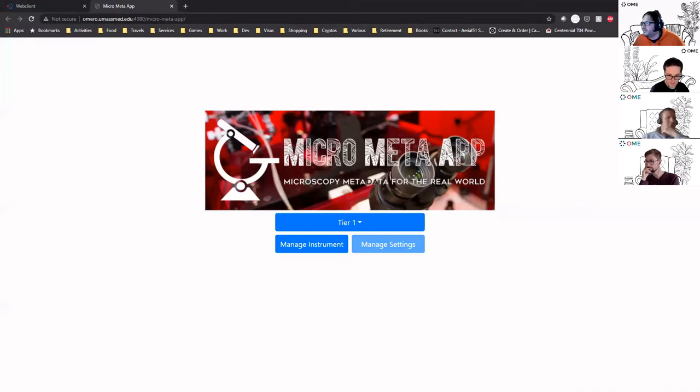There's a question in the chat from Asta, sorry if I don't pronounce it correctly. Is there a quick way to check manually if the metadata is correct, considering it is manually added, like maybe a quick browse? Can you try to explain a little bit better what you mean? Asta, could you speak? Do you hear me now?